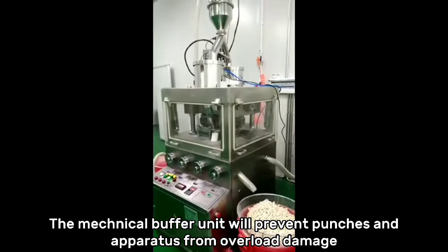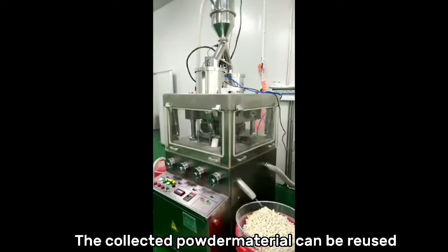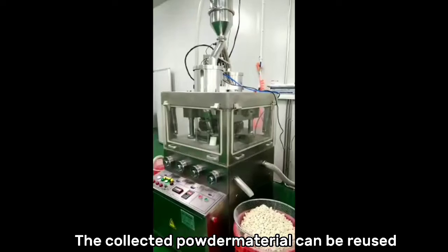The mechanical buffer unit will prevent punches and apparatus from overload and damage. The collected powder material can be reused.